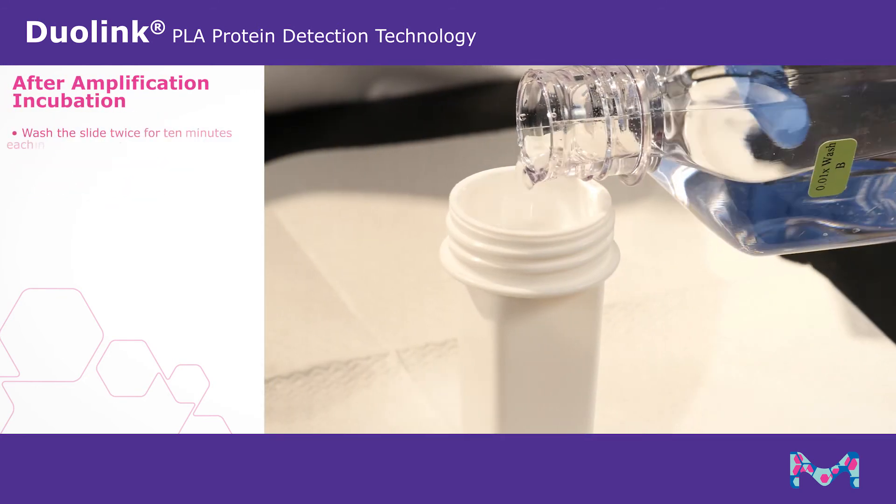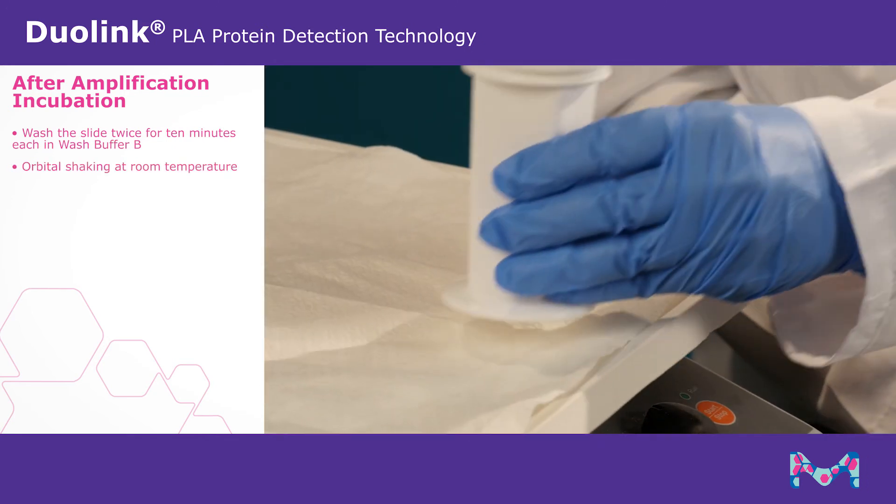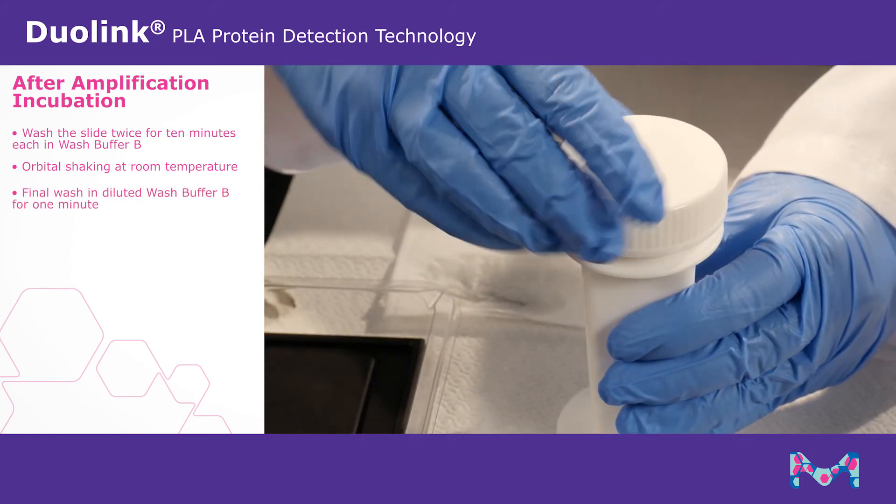After amplification incubation, wash twice using wash buffer B for 10 minutes each with gentle orbital shaking at room temperature. Then perform a final wash in diluted wash buffer B for 1 minute.